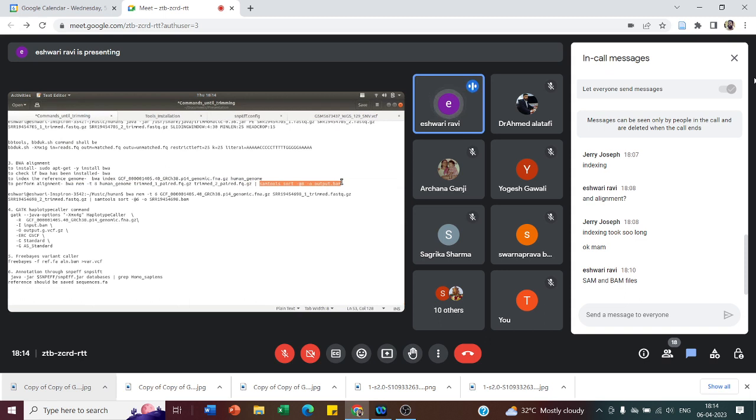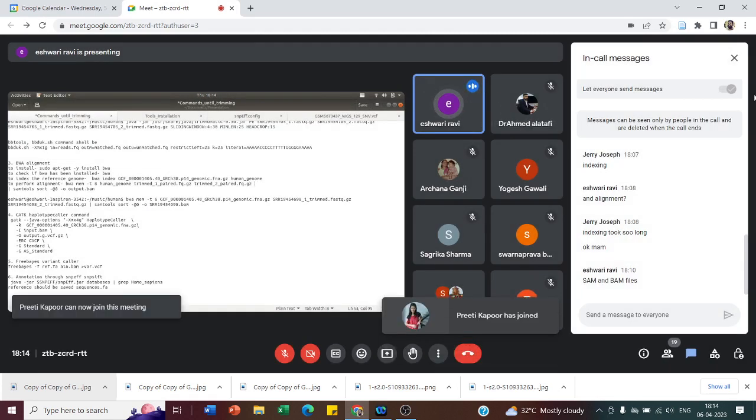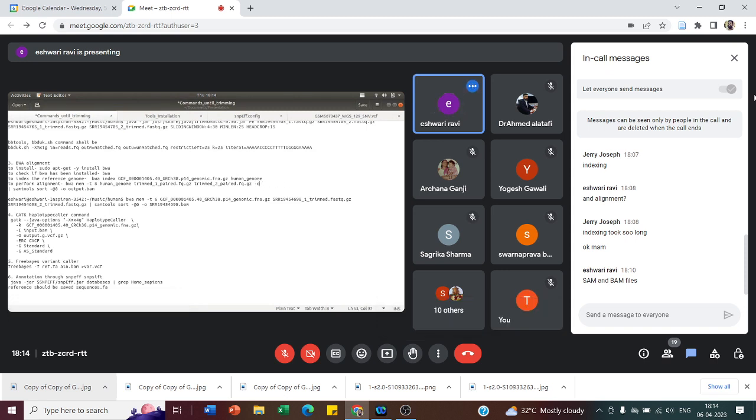I'm sorry if this feels a little out of track because this is a little of a computer language, but this is the simplest way I can explain. After you align, the output file comes out, and I can maybe write and show you. The actual output file you can either mention as -o aligned.sam, or -s aligned.sam, or you can directly give it as an arrow and aligned.sam. Either of the three, it will create a SAM file.